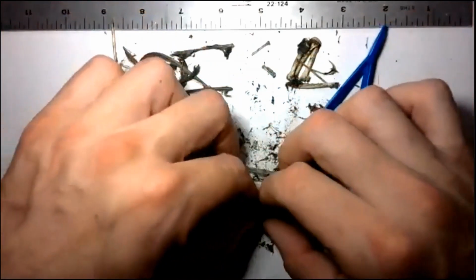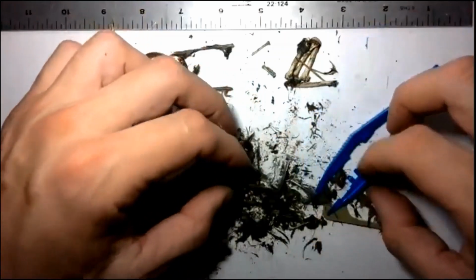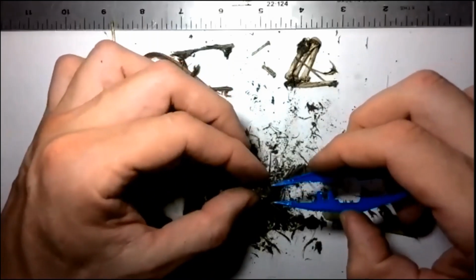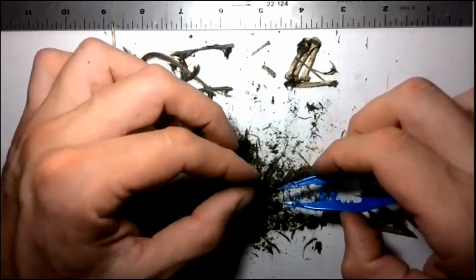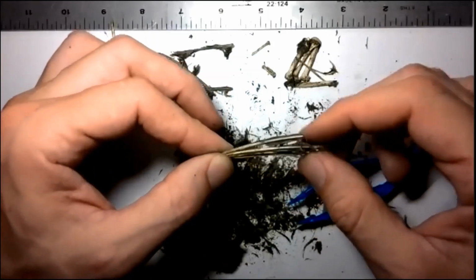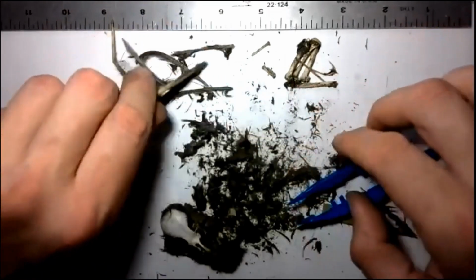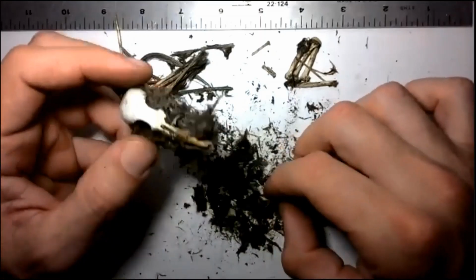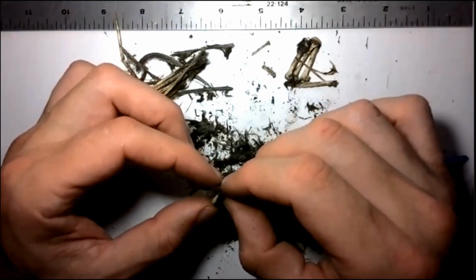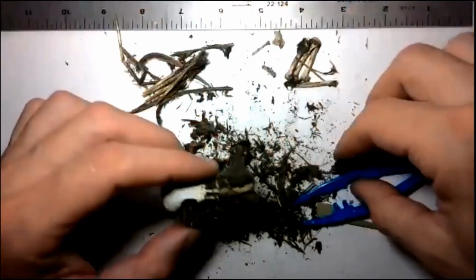And we haven't found toes or claws yet. No fibers, feathers. I think I found another bone here. Just checking the time, we're still doing good. Whoa, all right, this is the base of some feathers too. And just by this robust base, you can think probably it's part of the wing. Remember, this owl ate the entire bird, chewing and cutting it into pieces. Owls don't do like hawks or falcons that sometimes peel their birds, they remove their feathers.